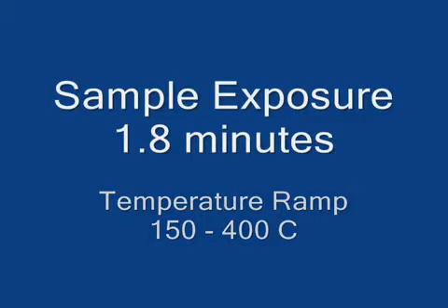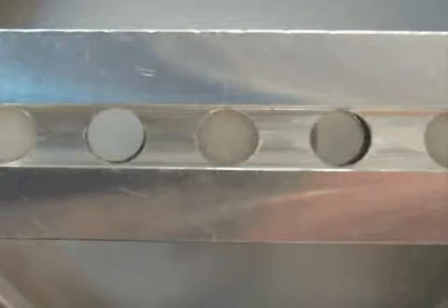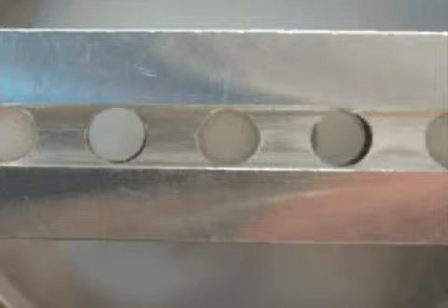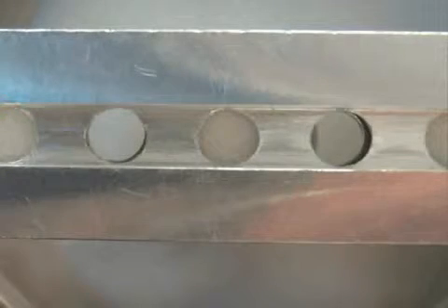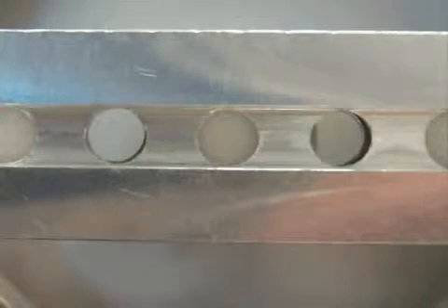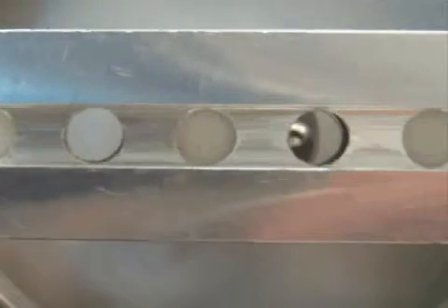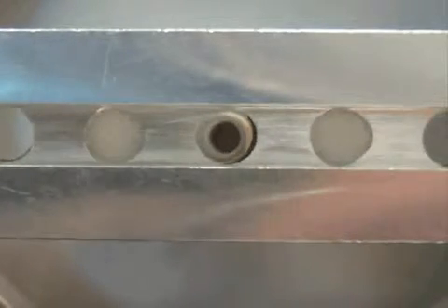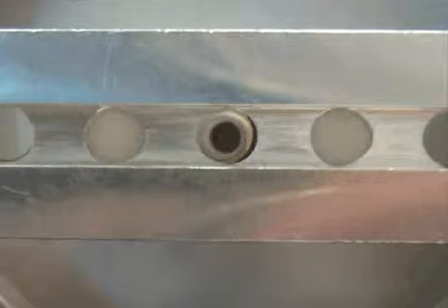After the desorption from the sponge has been completed, the module is advanced to the position where there is no sample in the way of the DART gas. The gas flows through without interacting with any surfaces, and the DART gun is allowed to re-equilibrate.